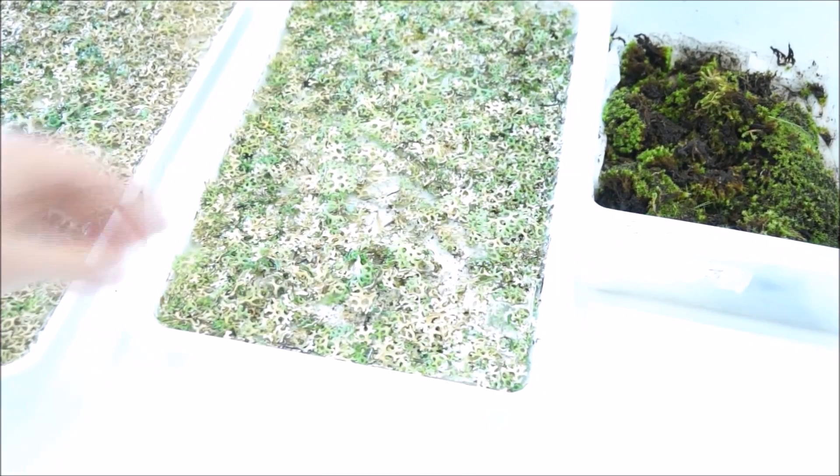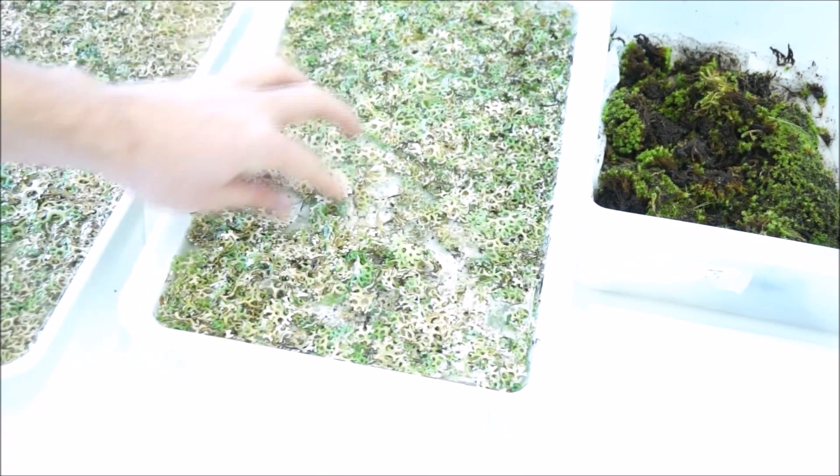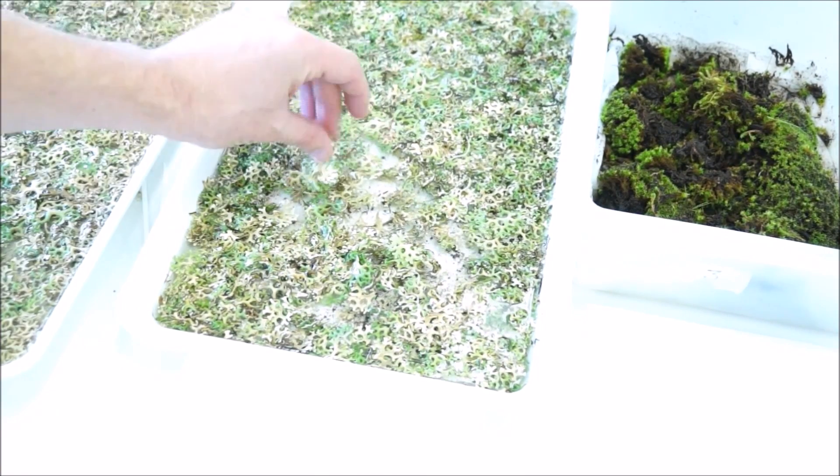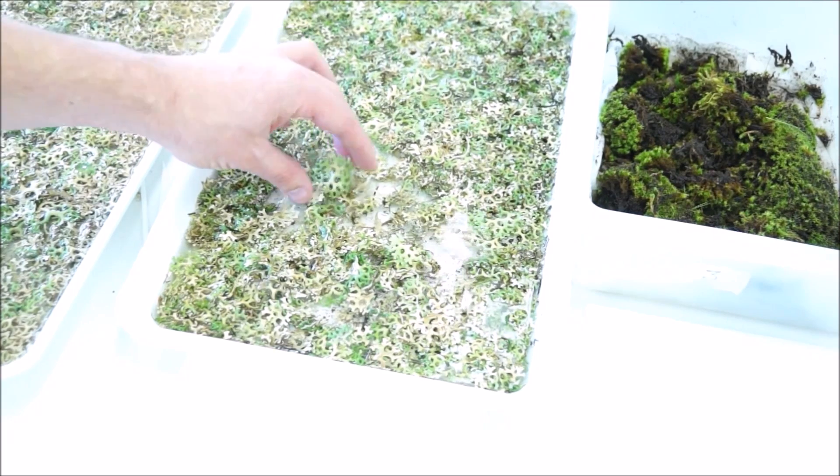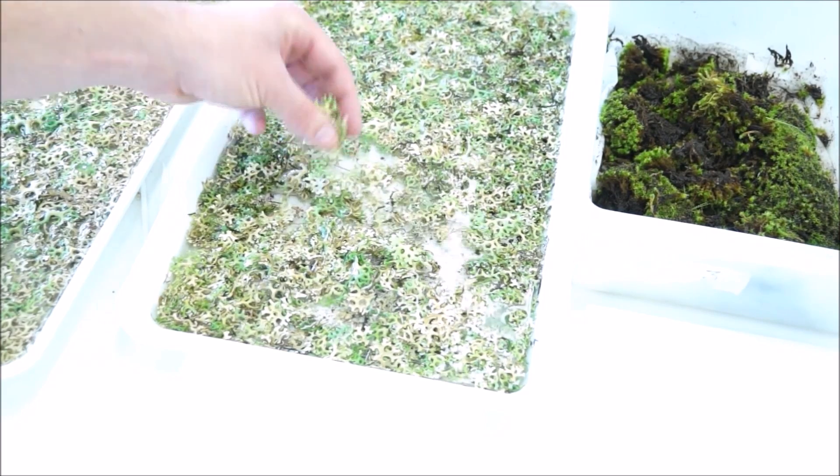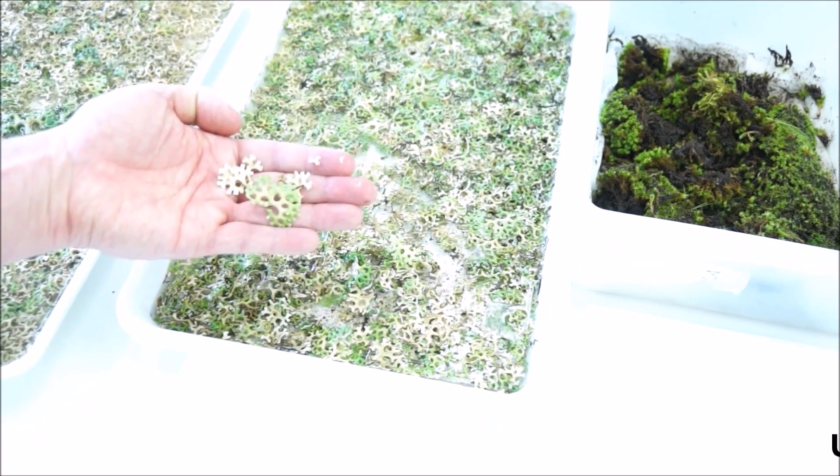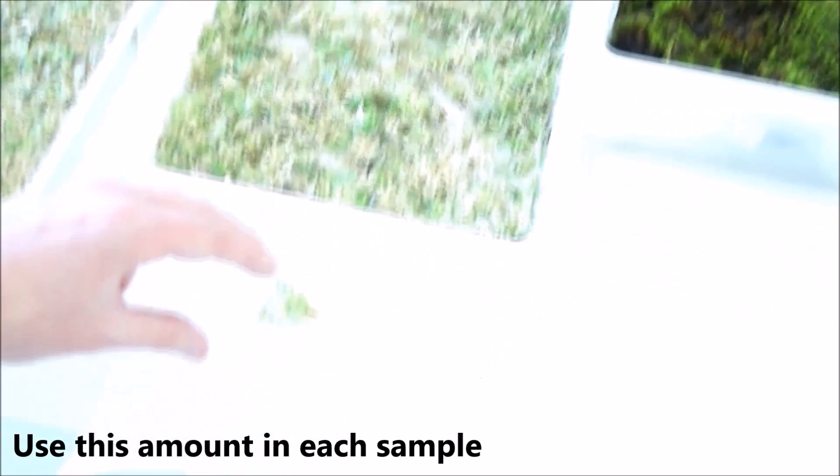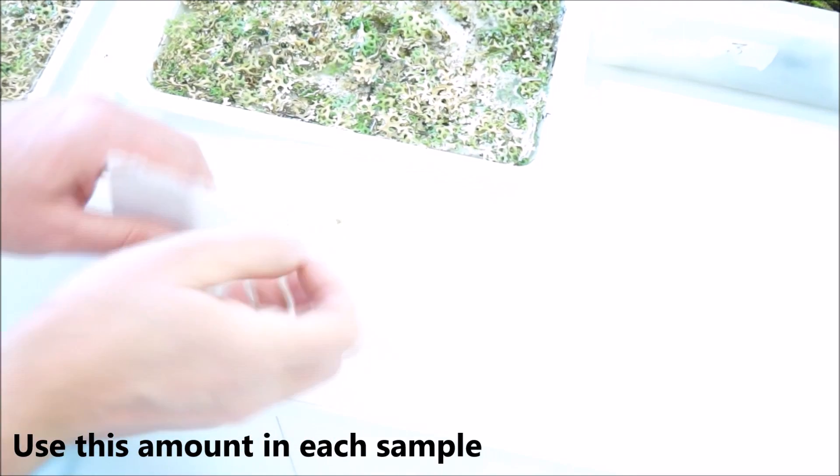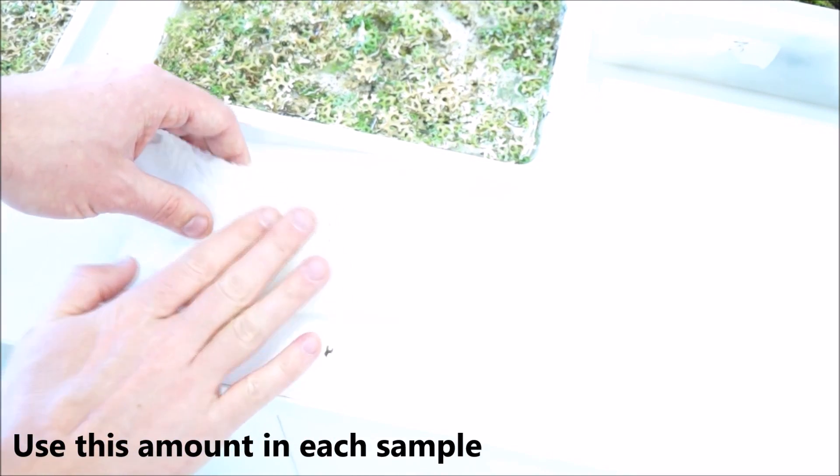The lichens are in water to maintain their turgidity, and so you want to be measuring water loss from the lichen, not from the surface. To get rid of any excess water, I'd grab a few per sample, drop them onto a piece of paper, and blot the outside dry. That'll be your sample.